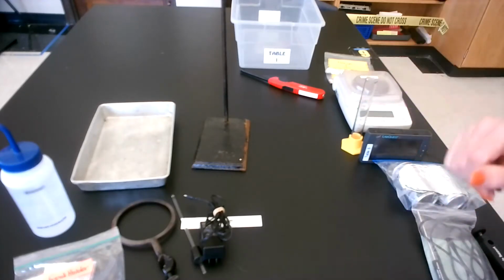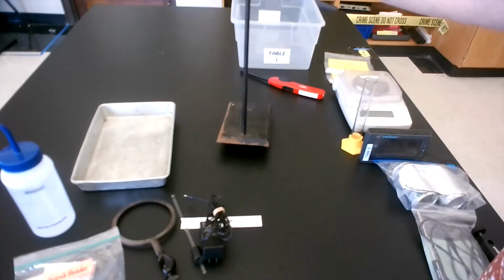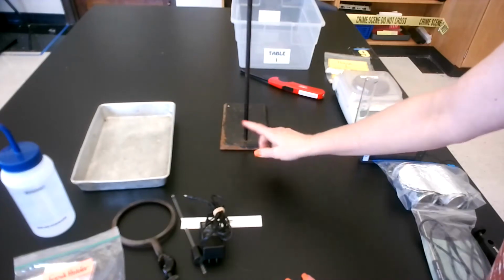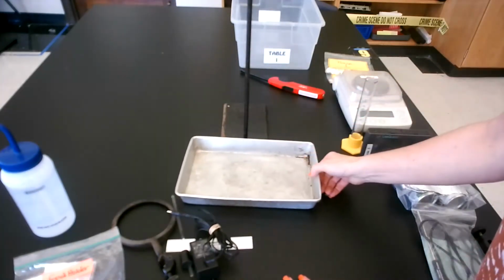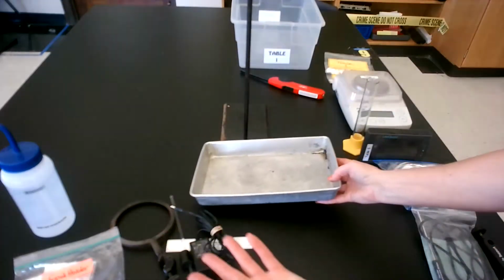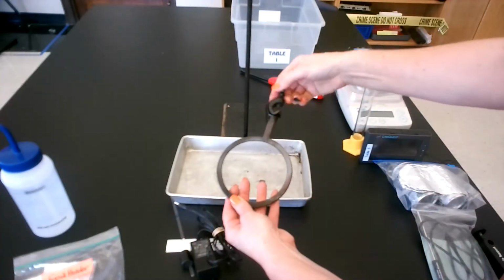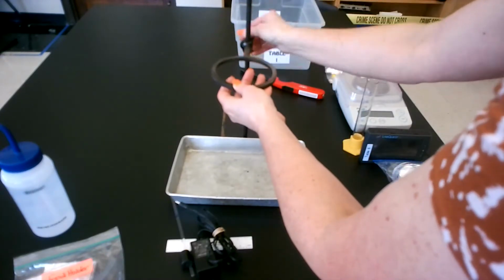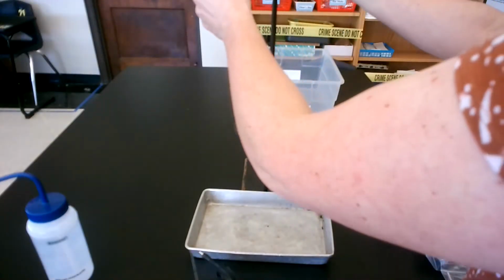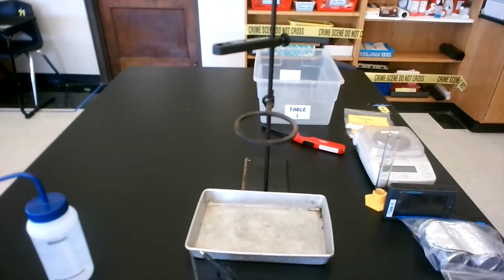So to set up, first thing we're going to do is build from the table up. So we're going to start with our ring stand. Let's say this is where I'm going to build my apparatus. I'm going to turn my ring stand backwards so that I can put my tray here, because I'm going to be moving my tray. If I put it here, there's a good chance that it's going to fall off and then everything's going to topple over. So I'm going to construct everything on the back of my ring stand. I can put my ring on. I will adjust the height in just a moment. There's just a thumb screw on the back. Just tighten that, just get it on there right now. Then we're going to put on our temperature electrode support and just move that out of the way, and we will readjust that later.